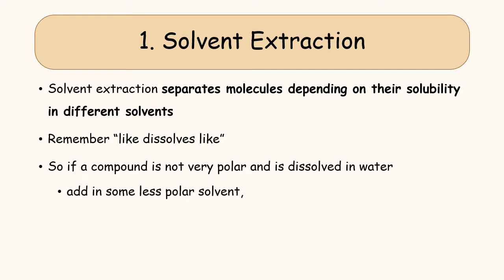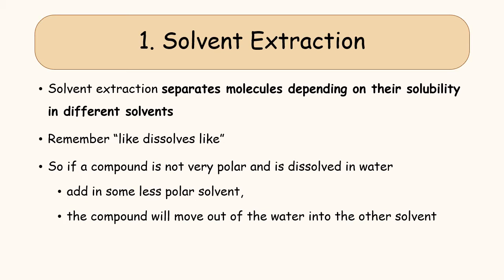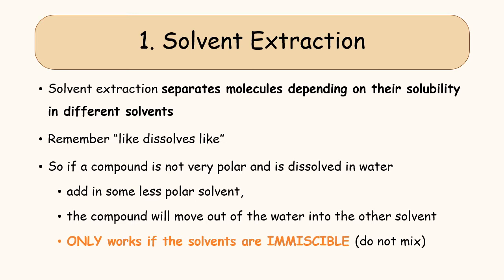However, if you add in some less polar solvent, the compound will be more soluble in that less polar solvent, and so we'll want to move out of the water into that other solvent. And so we can say that that compound has been extracted from the water into this less polar solvent.